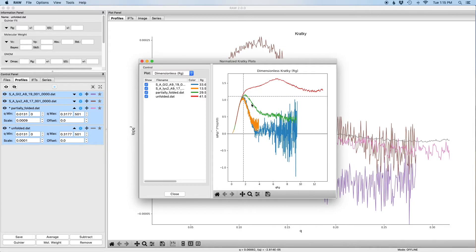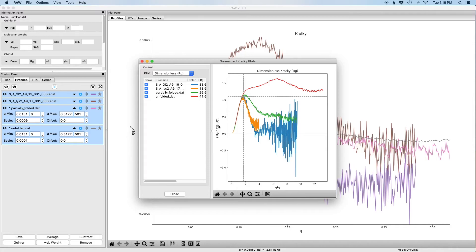So in the plot on the right, what you're seeing are the four different profiles. The colors correspond to the color bars here and these are now plotted on a dimensionless Kratky scale. So instead of being q squared times I of q versus q, it's now q times rg squared times I of q over I zero and qrg on the bottom axis.